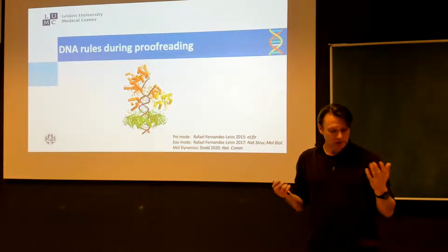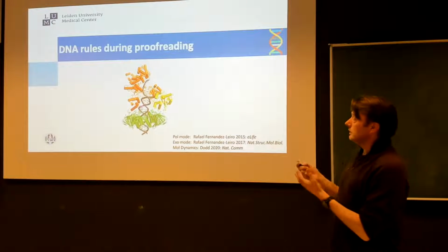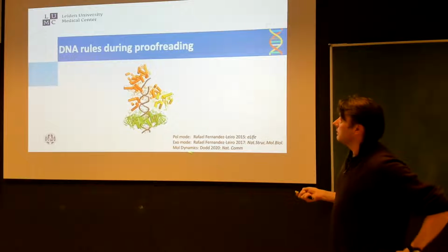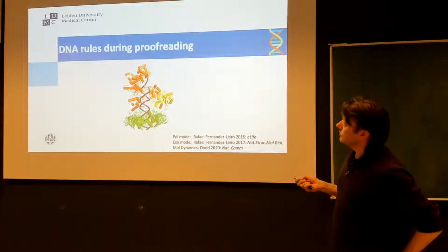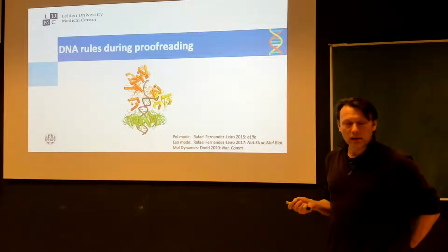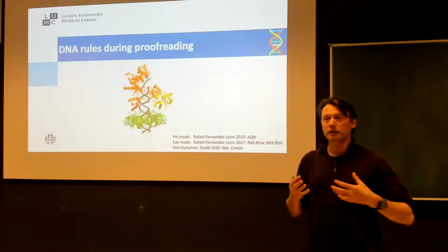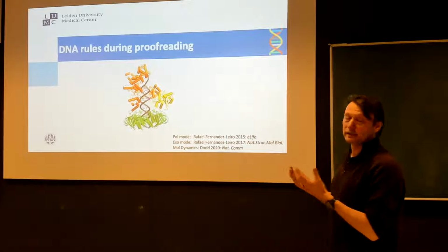And so we did a series of cryo-EM structures, one in the polymerase mode and one in the exonuclease mode. And we also did some molecular dynamics on that. And what it showed us is that this DNA strand is moving about 60 angstrom from one active site to another active site. But when you look at it, it's all the DNA is doing the work. So the proteins are sitting there and they're being fed the DNA. So it's actually the DNA that makes the choice.